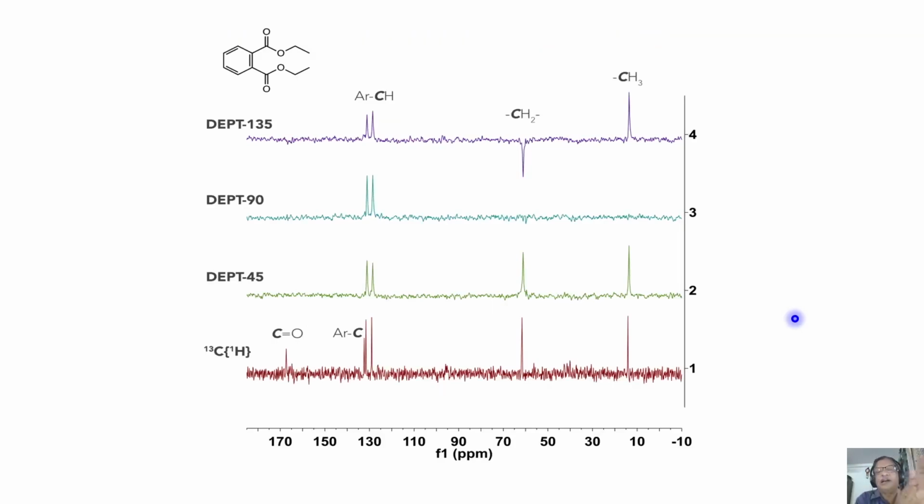Today what I discussed is in carbon-13 NMR. The most important point you should understand: we can get a fully decoupled carbon-13 spectrum with various possibilities of decoupling. I explained already. Normally, what you do is decoupling with NOE. You get a single peak for each carbon, in which case assignment is a challenging task. You have to assign which carbon corresponds to which group, whether it is a CH3 carbon, CH carbon, or CO carbon, etc. One way is you have to do the coupled spectrum and make the assignment.